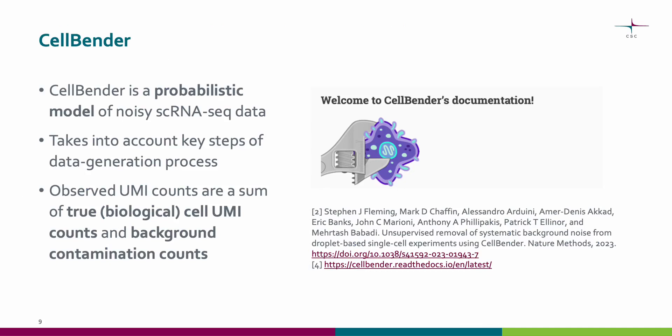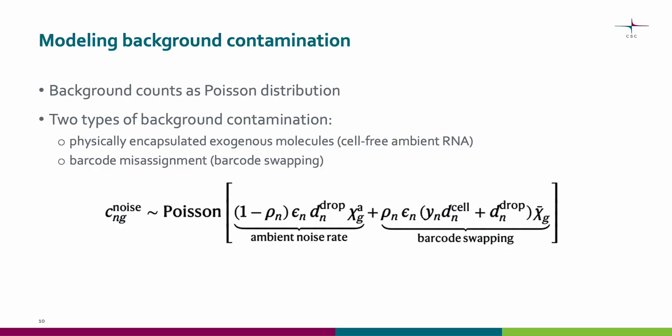So how does CellBender remove background contamination? CellBender is a probabilistic model that takes into account key steps of the data generation process, including droplet formation and cell encapsulation. CellBender models the observed UMI counts as a sum of true biological cell UMI counts and background contamination counts. The background contamination counts are drawn from a Poisson distribution, where the noise rate originates from two different contamination processes, which include cell-free ambient RNA and barcode swapping.